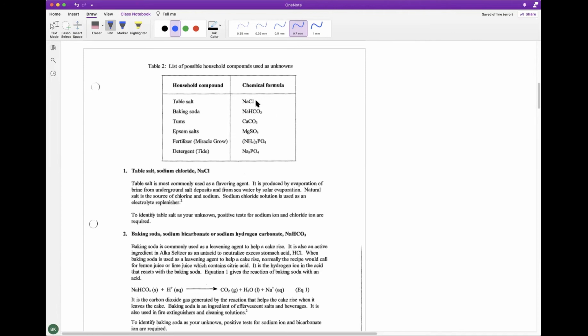So you can take sodium chloride, put it into water and stir it up, and it will dissolve. And what you get is a clear, colorless solution, which is salt water. But again, if we do that with baking soda, eventually we stir it up, we get a solution that's clear and colorless.